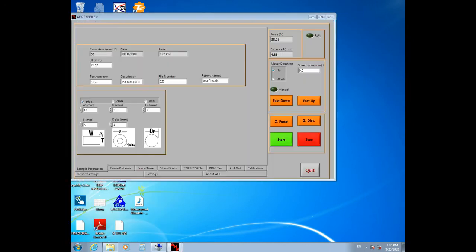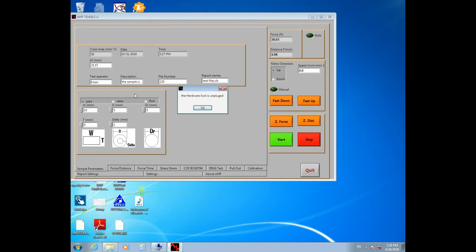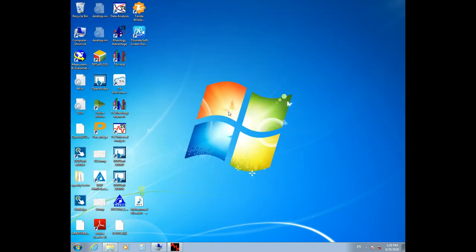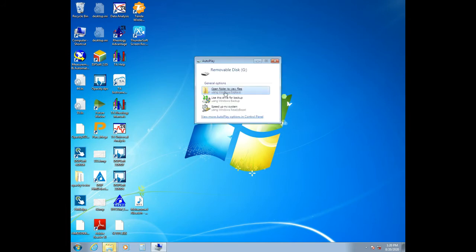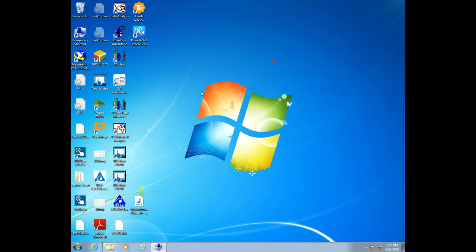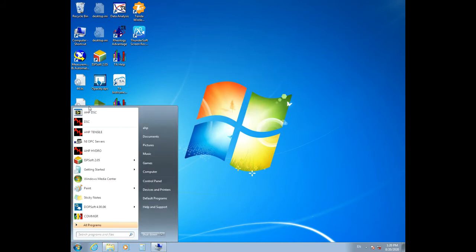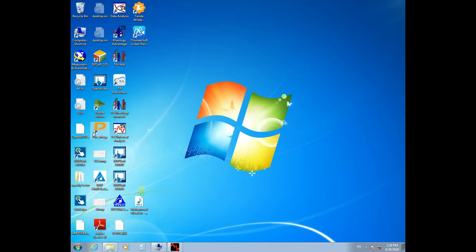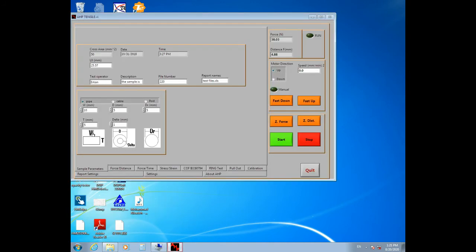You see, I disconnected the flash from the computer and the hardware lock unplugged error is shown on the display. So connect the USB flash to your computer and open the HP Tensile program again.